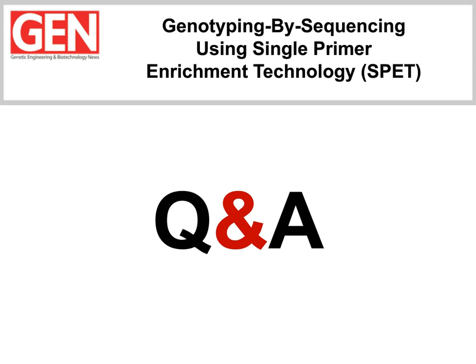And David, is there any issue related to low complexity of sequence spaces? Fortunately not, because NuGen managed to put some random varying length linker adapters on their construct.